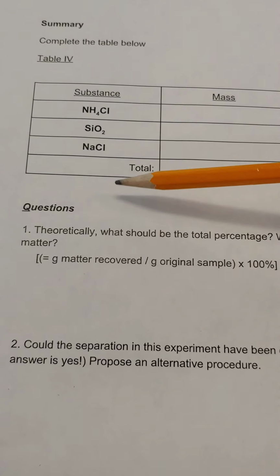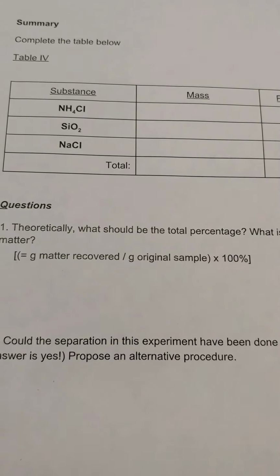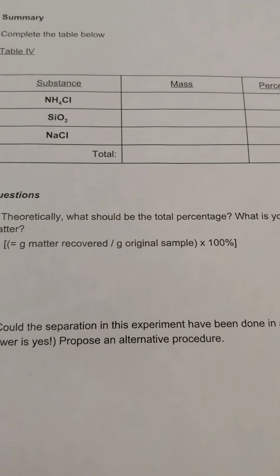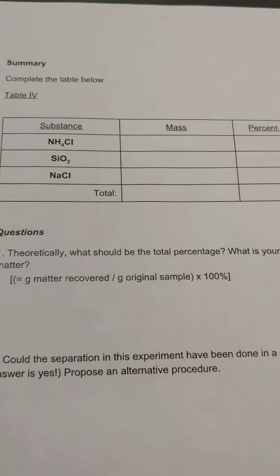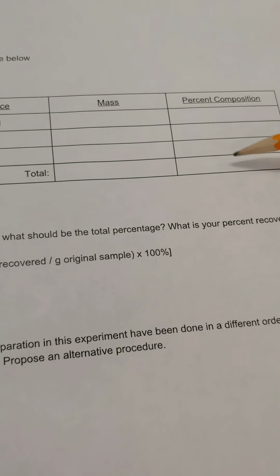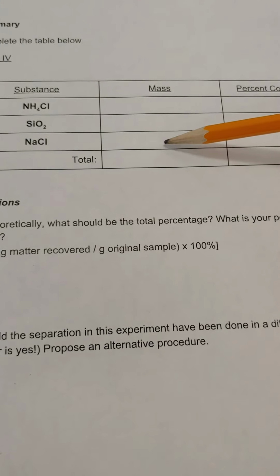After you filled in that table, theoretically, what should be the total percentage? Well, you can think about that, and I'm not going to give you the exact answer, but what is your percent recovery? When you add up your three values, what do they add up to? What is the mass they add up to, divided by the original sample, times 100?